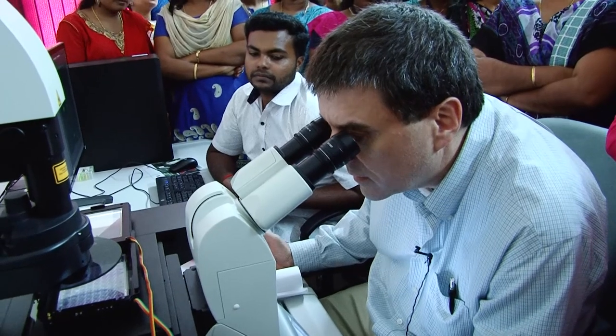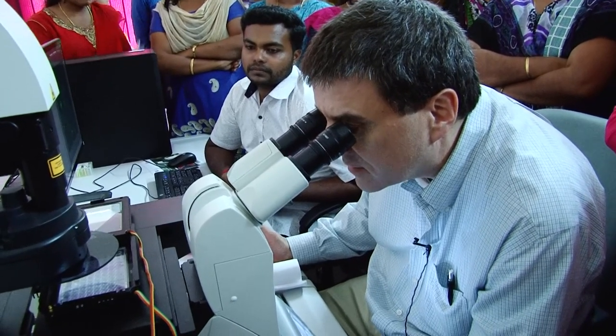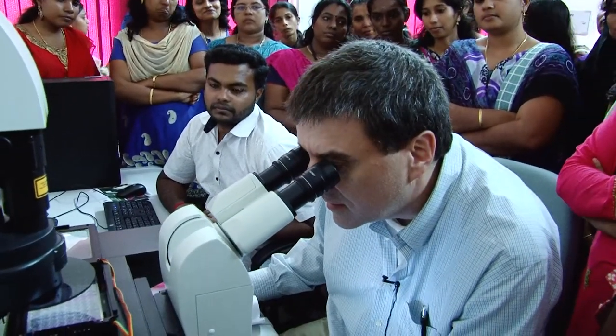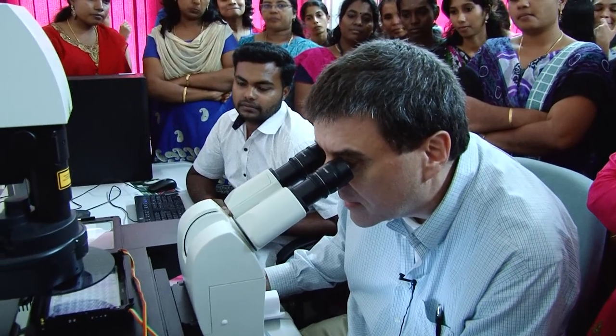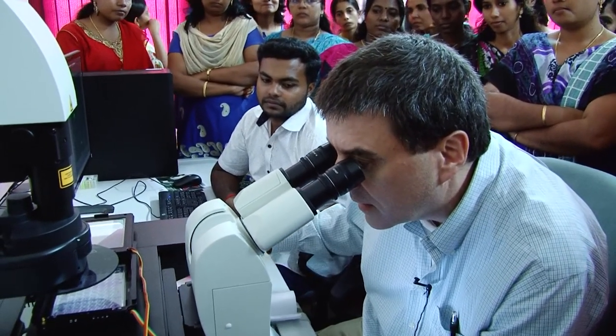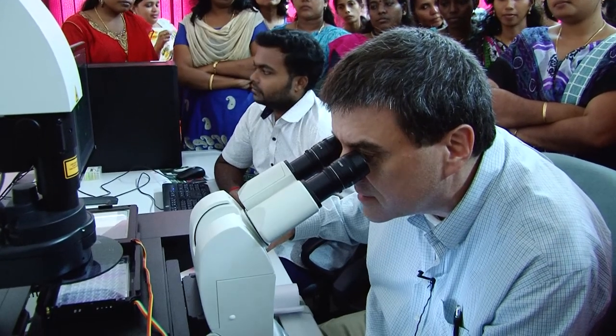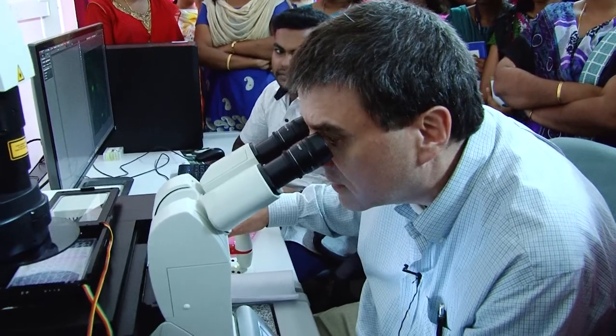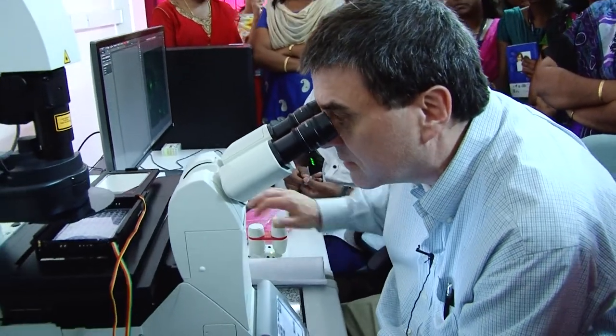To examine, to try to find the cells unstained, but the problem is the samples are in a plastic dish, so you can't use DIC. We're limited in that respect. And again, I can't seem to find the cells. So we're just going to move on for the sake of time, because I'm just not finding them. Keep them here, we'll look at them after 5 o'clock. I just can't find anything, just like yesterday, same problem. I wish I could, but I can't.